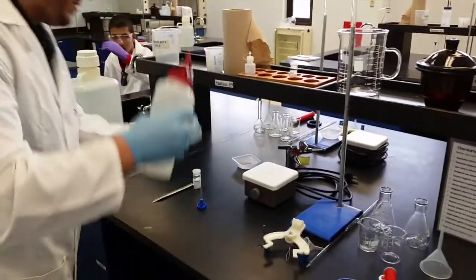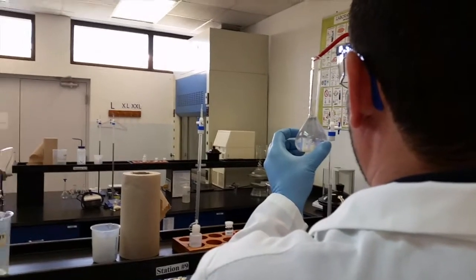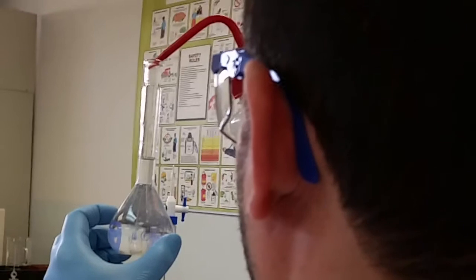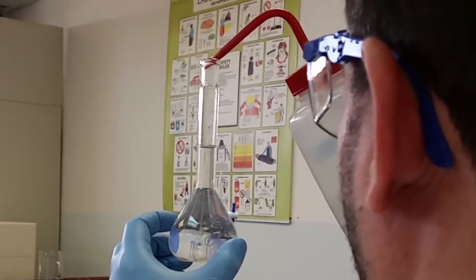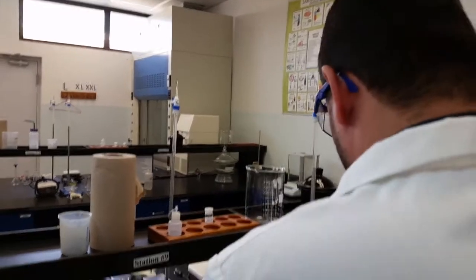Now I will add to the mark. I align my eyes with the mark, so I see one line, and I add the water slowly. If you want to use a water dropper, you can use it. That's adding water to the mark.